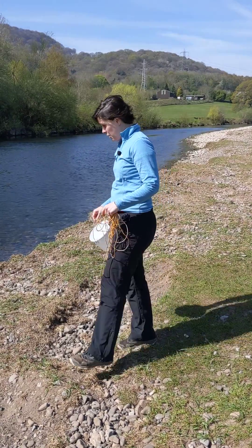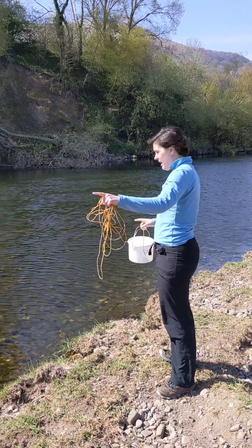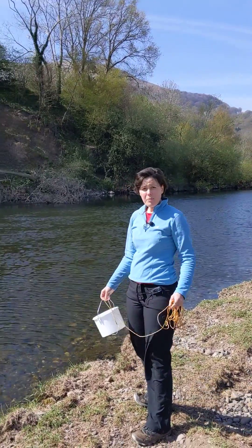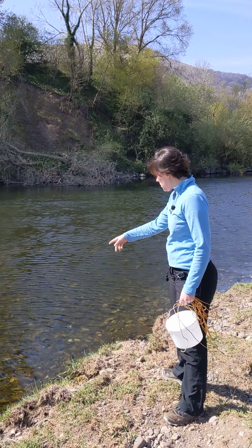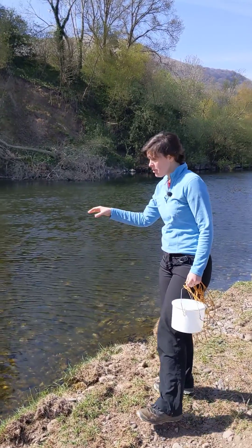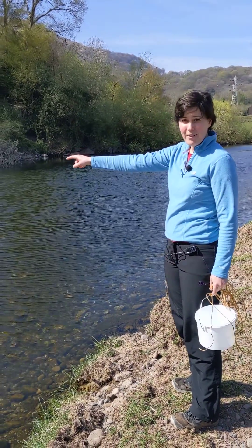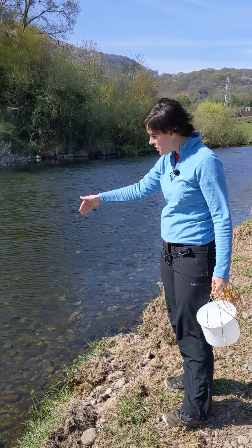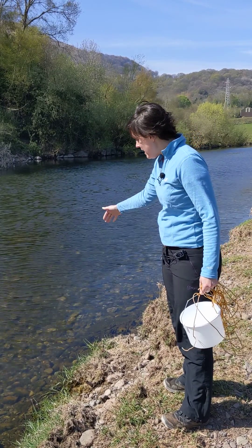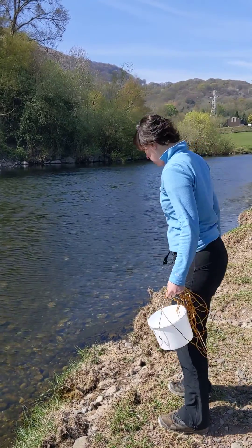Ready to collect your sample, approach the river and take a good look around — check that there's nothing upstream or downstream that you need to be aware of. Take a look at the water; you're trying to capture a sample in the main flow. Ideally you'd be right out in the center of the river, but that's neither safe nor practical. Find a place near a safe sampling spot where you can access the main flow. Here looks pretty good.